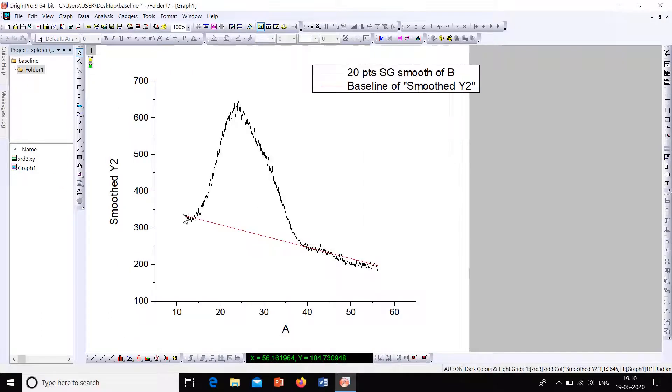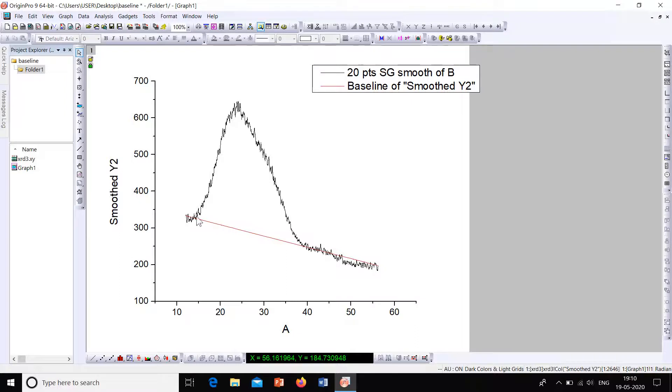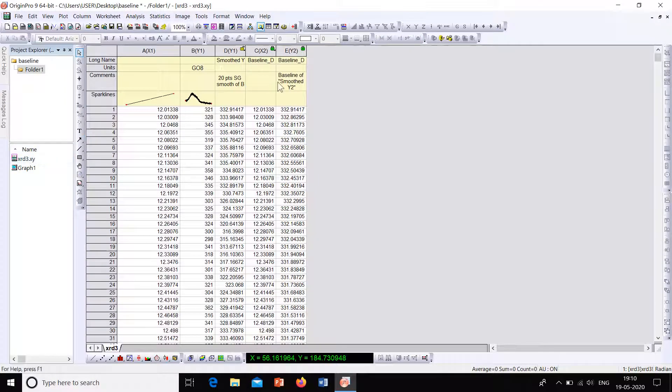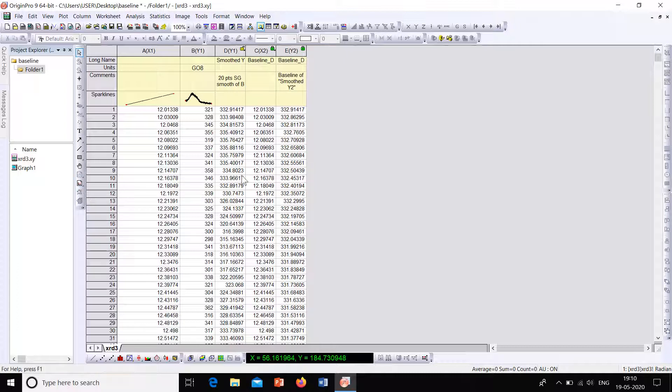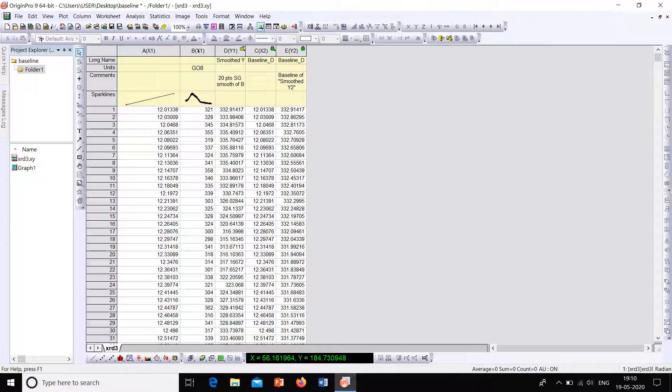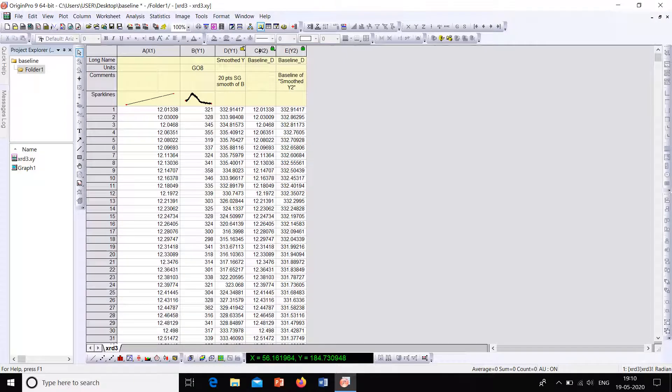So this is the plot with a baseline. So now how to update a baseline corrected curve. For that go to the workbook. There you will be having two baseline points as well. Before creating the baseline we had only three columns here. One is the X value, one is the Y value, and this is the smooth value. Now we have two more columns which is showing the baseline points.